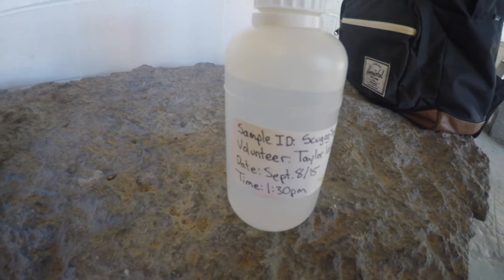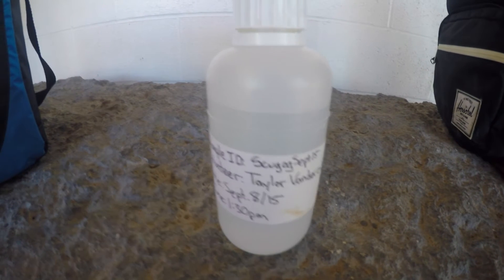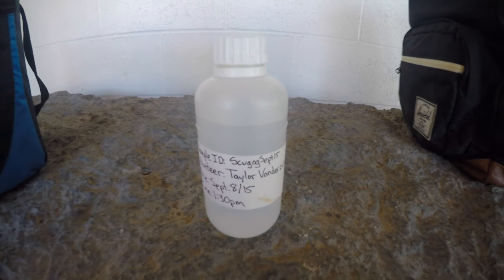Please remember to fill out a KLSA label that will contain a sample ID, volunteer's name, the date and the time, and affix this label to the bottle. Also remember to fill out the E. coli log which comes with the sampling bottle and the chain of custody form for the lab you are taking the sample to.